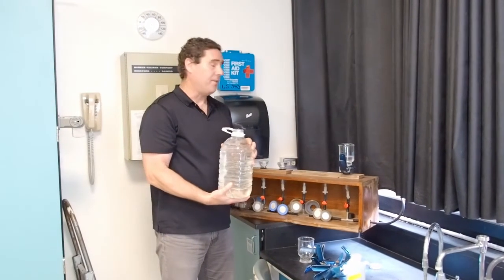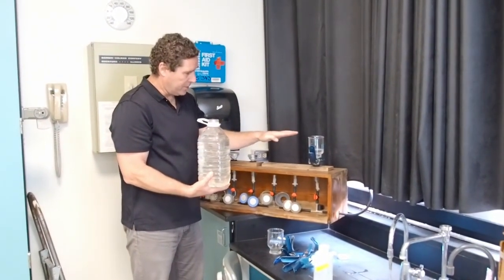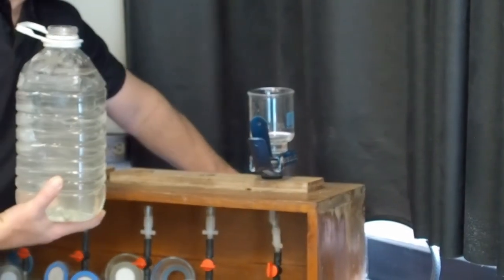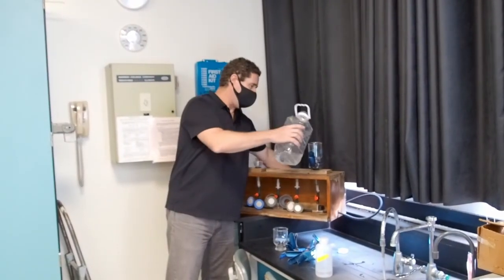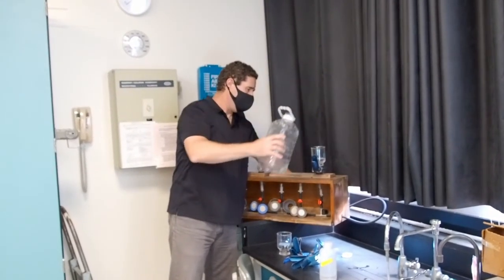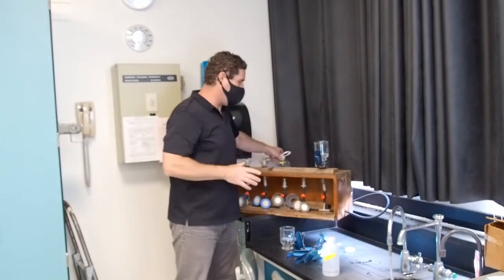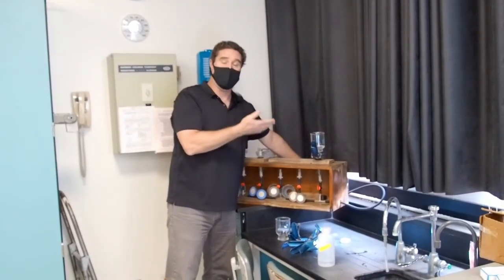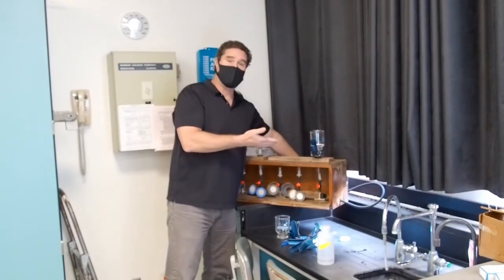And if you're zoomed in enough, you can actually see the water is slowly going down as it travels through the filter. So we've sucked our sample down. This is the last little bit of it. 4 liters of water. And after this filters all the way down, we'll have our sample ready on our filter.